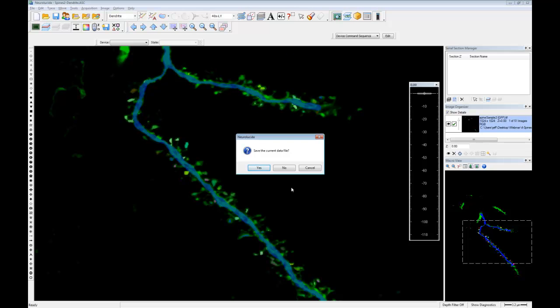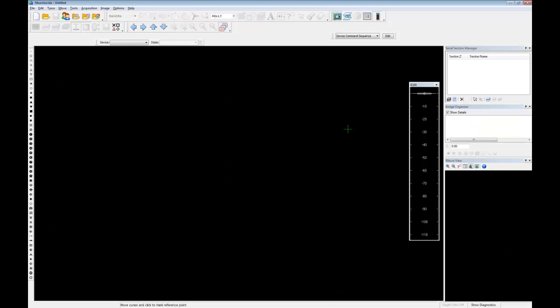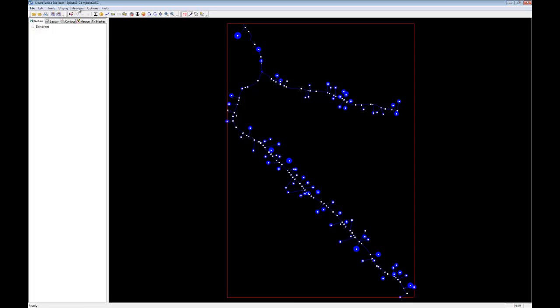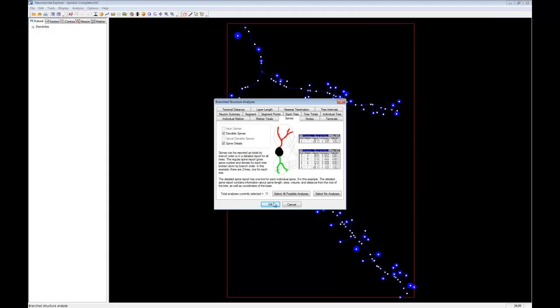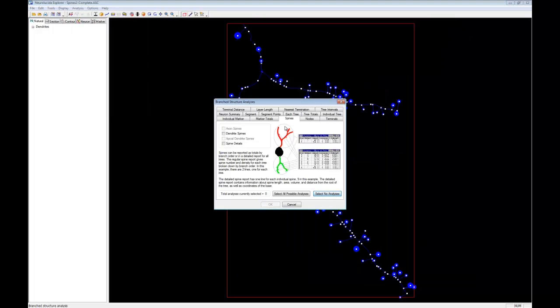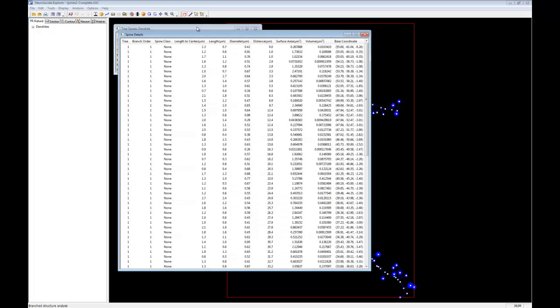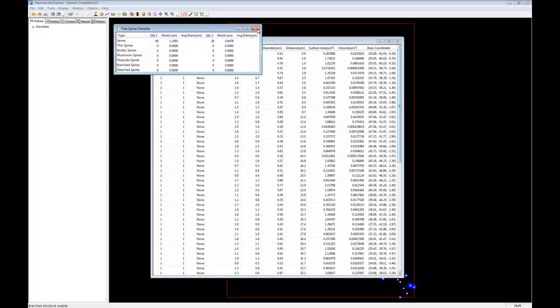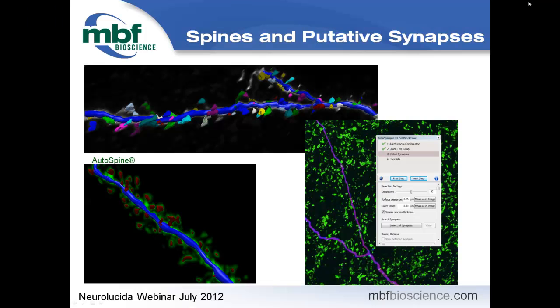Bringing up NeuroLucida Explorer with the completed spine model, you go to Analysis and Branch Structure, then look at spines. You get a list of every spine: which tree they're on, their branch order, length to center, length to surface, position, volume, and surface area. You also get a summary including spine density — spines per micron.